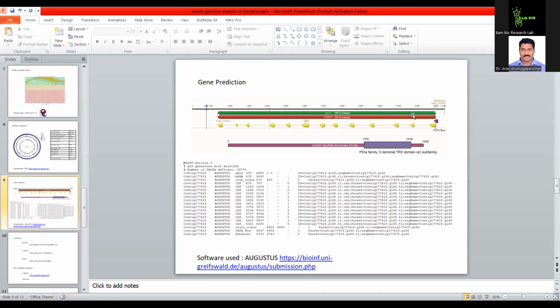that is reverse direction. So on the right side, you are seeing a start codon, and before that you have an enhancer sequence, then TATA box, then the green region is the gene of 5810 bases. From the gene, the red color line indicates the mRNA or the complementary DNA. Then from the mRNA, you get the CDS regions, the yellow color arrow marks.